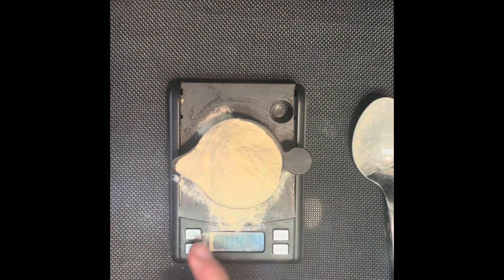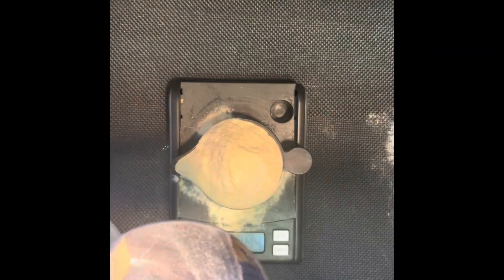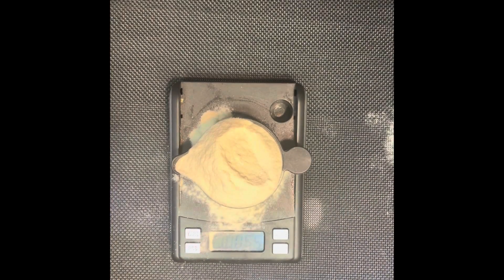For the next step, you want to measure out 10 grams of agar agar powder. And then after you've measured that, you want to measure out 10 grams of malt extract.